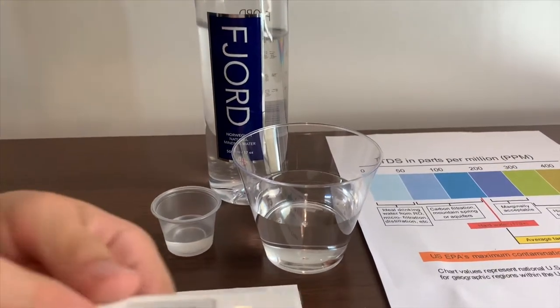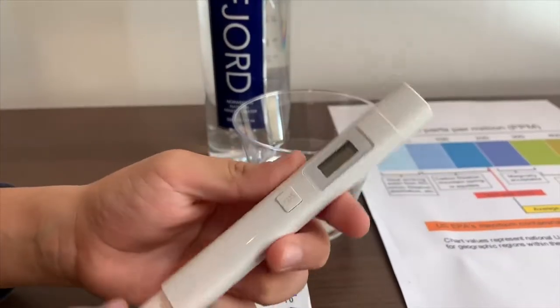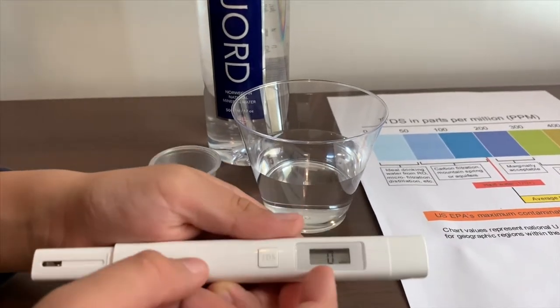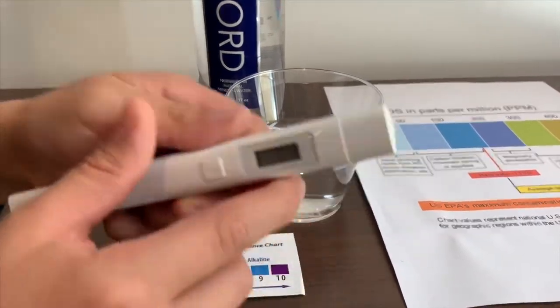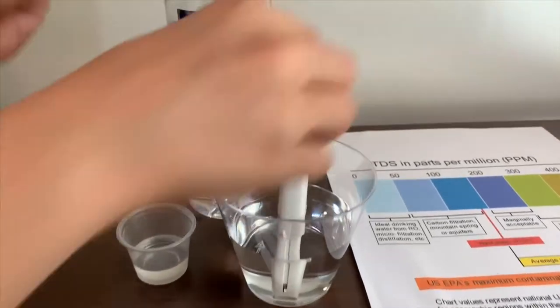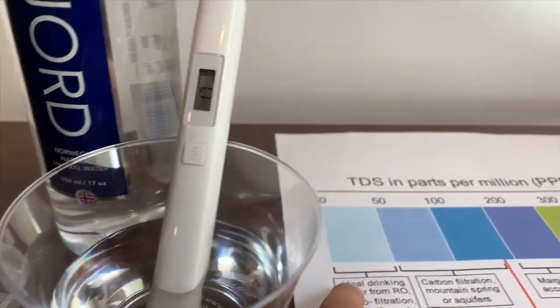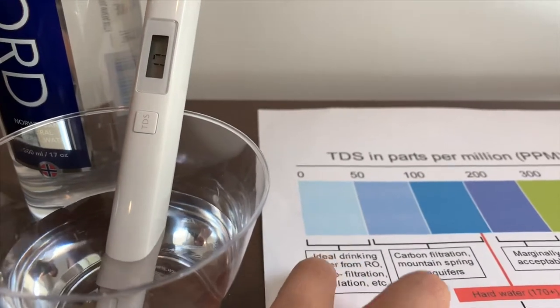If you want to buy this TDS tester, the link is down below. Turn on the TDS tester, make sure it says zero and let's put it in. 15... 17. That is ideal drinking water.